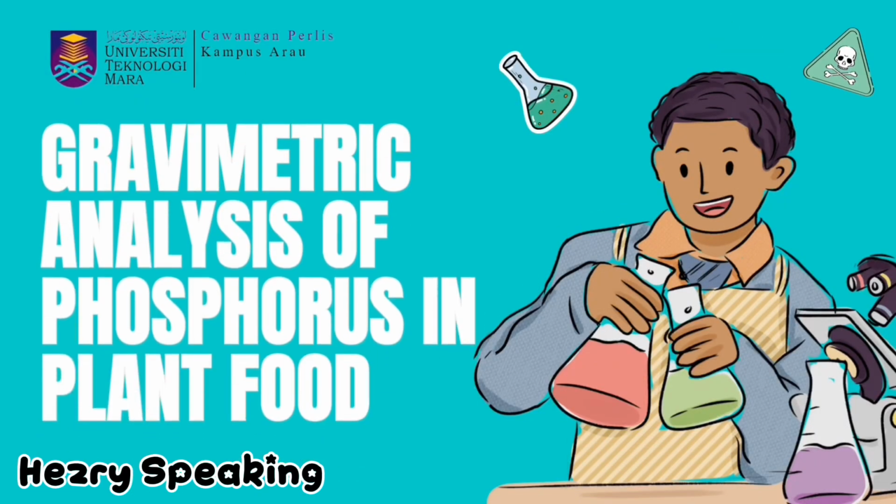Assalamualaikum. Today I would like to present experiment 12, gravimetric analysis of phosphorus in plant food. This presentation will cover the objective, procedure, results and calculation, discussion and conclusion.